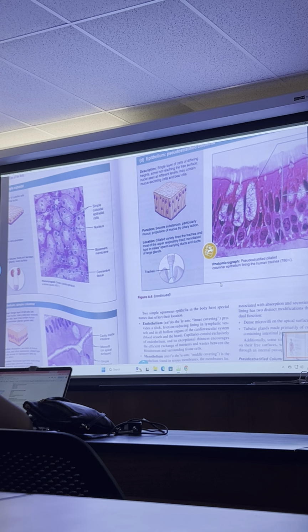It's got keratin in it. Remember the granulosum was stuffing keratin into the cells because you don't want to rub off all your epidermis, so you make it thicker. So keratinized, stratified, squamous epithelium. That's epidermis.